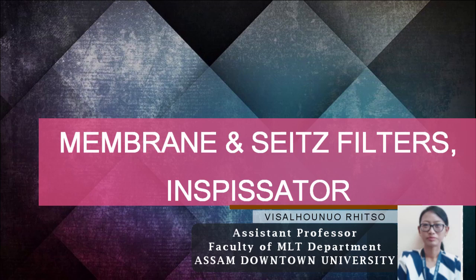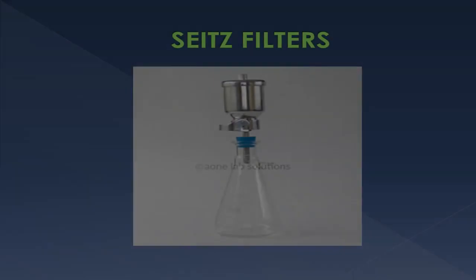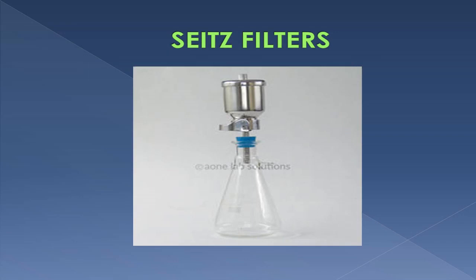Filtration of air is accomplished using a high-efficiency particulate air filter, designed to remove organisms larger than 0.3 micrometer from isolation rooms, operating rooms, or biological safety cabinets. Such filters are filter discs with pores so fine that they will not permit passage of bacteria, such as the asbestos filter used for removing bacteria. These filters are usually made of asbestos.